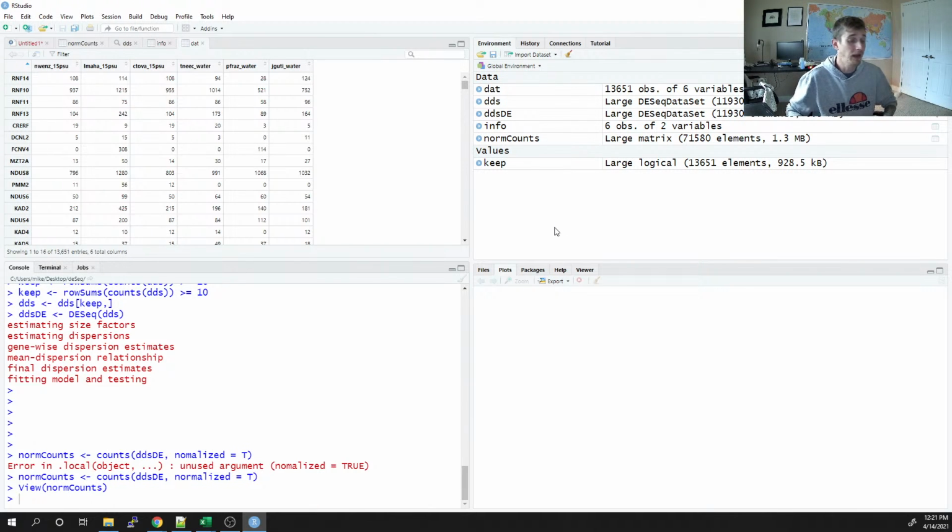It's stupid to estimate expression on non-normalized data. We always have to correct for variation in the data, and that can include size of the library or the number of mapped reads, standard deviations, etc.